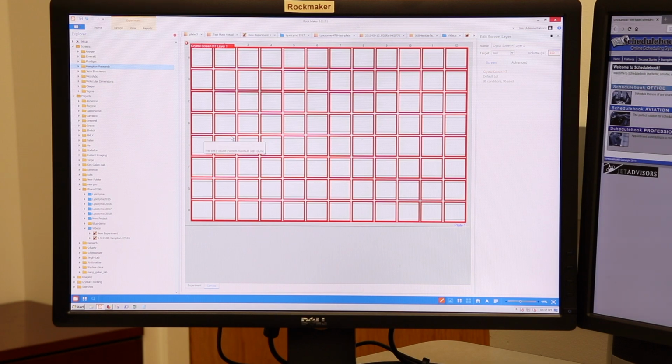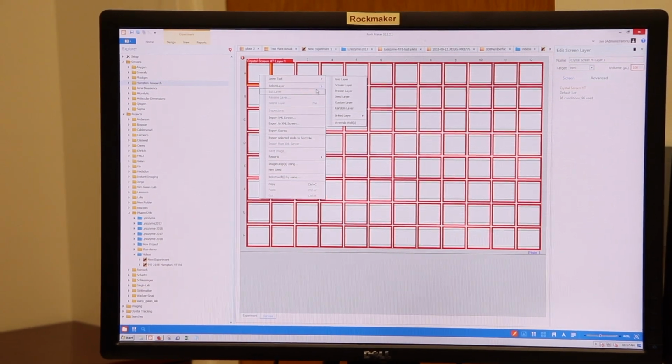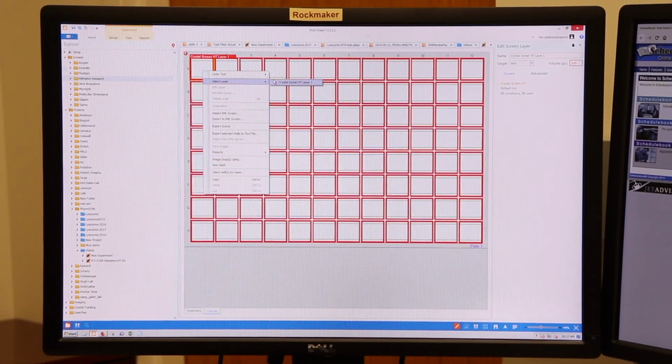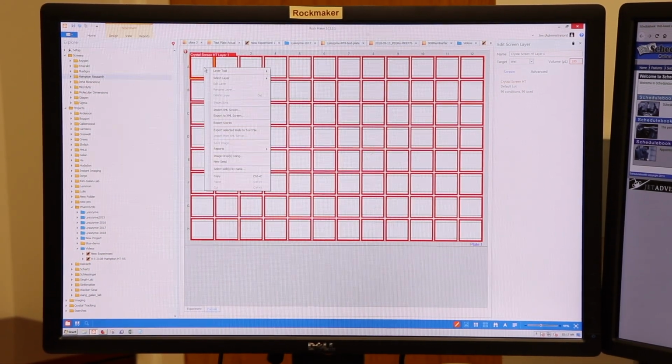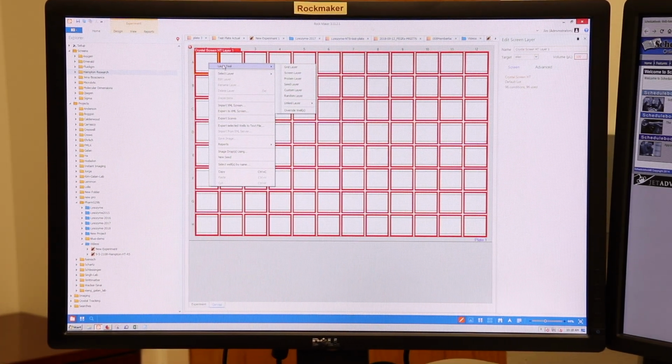All right, pause that. Well, you can just snip this out. Hold on a second. Yeah, pause it for a second, but I think we can pick back up where we were. Yeah, let's put it up.